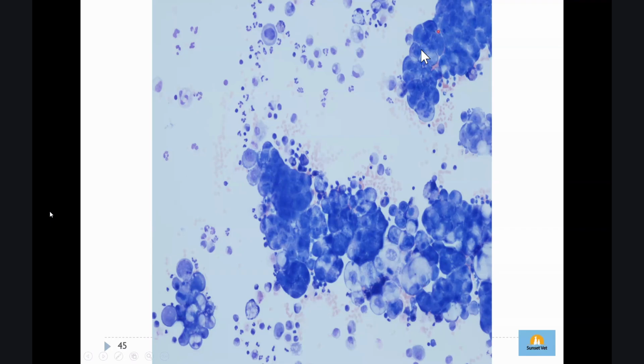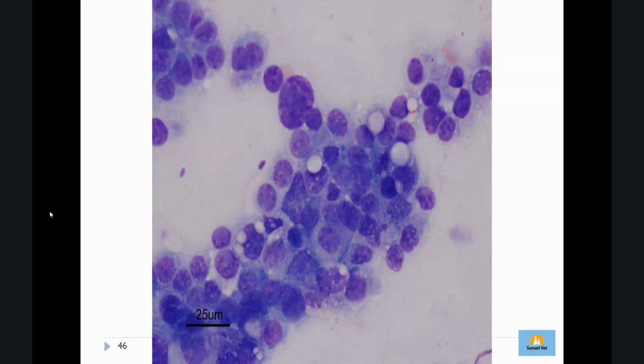Okay, let's see. Dr. Stephen, I noticed this one. This is one cell, but it looks like they have the nucleus and then something small here. It is like a nucleolus. So these are very actively dividing cells. It means this cell is actively growing. So you can mention to the owner, yeah, this is typically not a good sign for cells because they are growing. Then how about this one, Dr. Stephen?